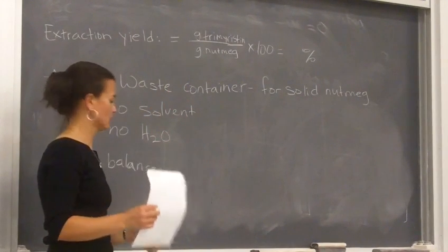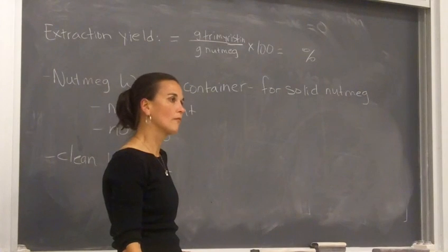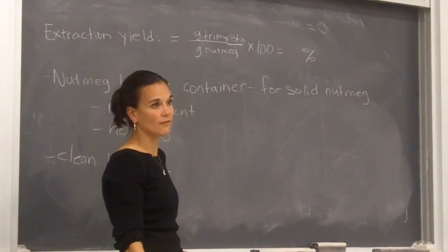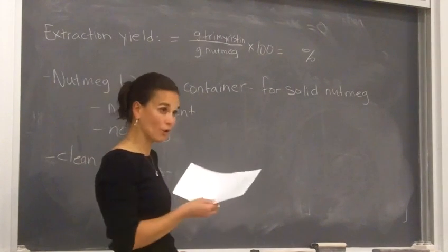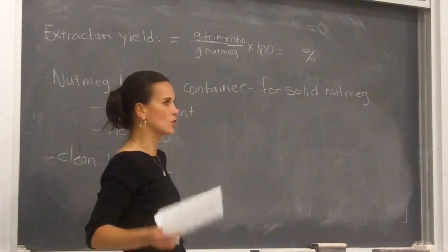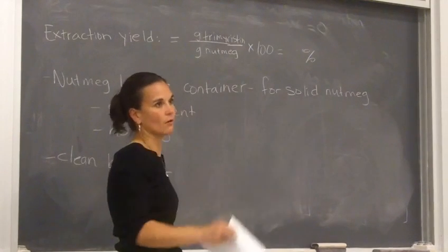On the pre-lab, so since we already drew in the distilling apparatus from the first lab, do we have to go again? No, this is only new equipment, so that's why you just need to show the reflux apparatus and the gravity filtration, but you don't have to use the simple distillation. Now what you want to do in your write-up as you're writing your experimental for experiment 3, still when you do the simple distillation, refer back to that page of your pre-lab of experiment 1, saying that it was set up like page so-and-so, okay?